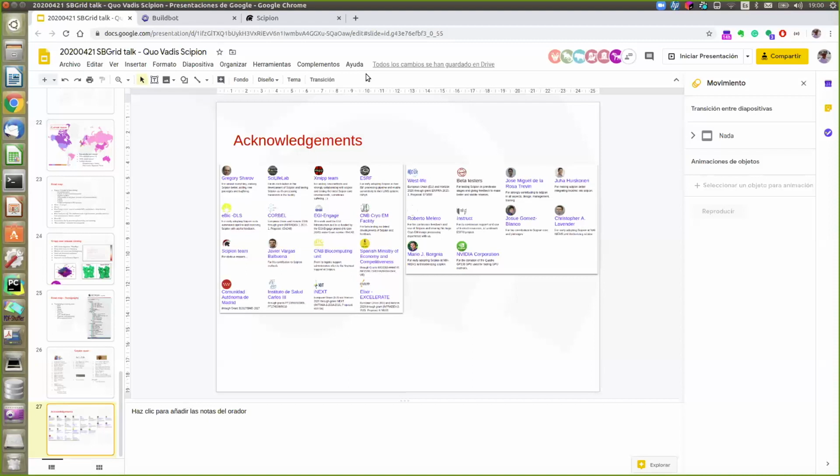Okay, great. Yeah, I realize it's impossible to give any accurate date for software releases. On that note, when the 3.0 version releases, will you continue to support previous versions for any length of time afterwards? Well, we usually support the current release version and the previous one. Okay, so 2.0 will still be supported. Yeah, to be honest, 2.0 is already there. It doesn't now require much support. We have already, today, released a new version of the Sphire plugin with Cryolo.